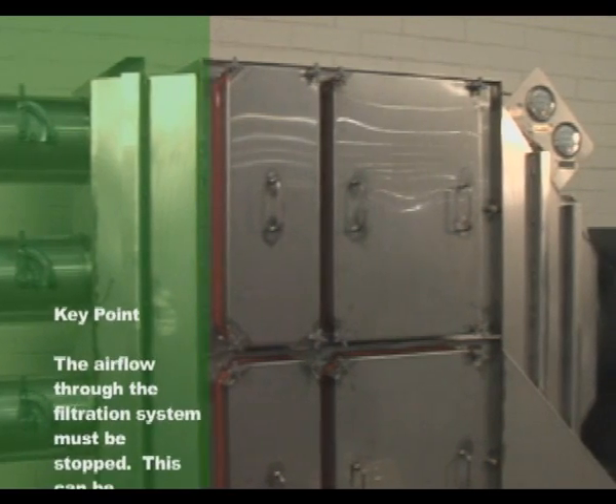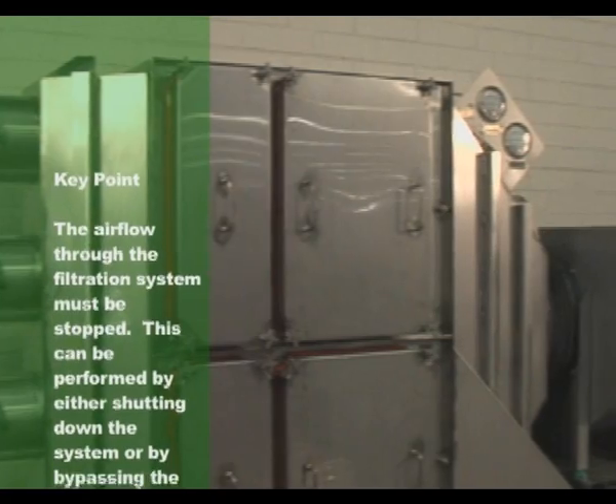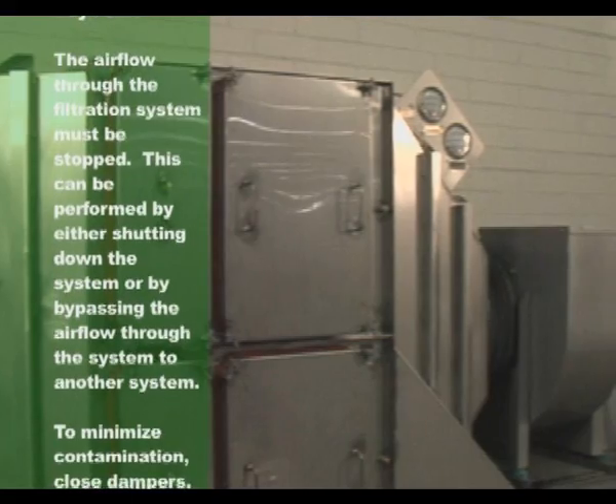Prior to replacing a contaminated filter, the airflow through the filtration system must be stopped. This can be performed by either shutting down the system or bypassing the airflow through the system to another system.